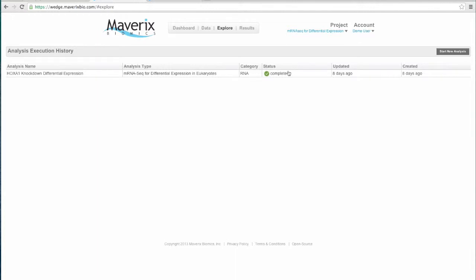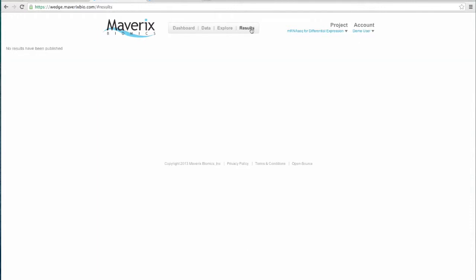I'll show you in just a moment when we launch an analysis that you'll be able to see the most recent analysis that we've launched, and it'll have a status of running. And you can actually begin looking at that data as it's coming off from that analysis while it's running. So in real time, you can check on it and see how far it's progressed. And any of the outputs that are currently available, you can start looking at and potentially downloading from the platform.